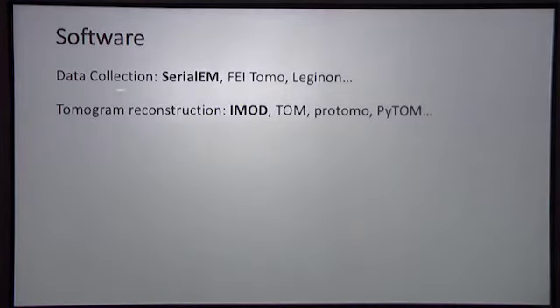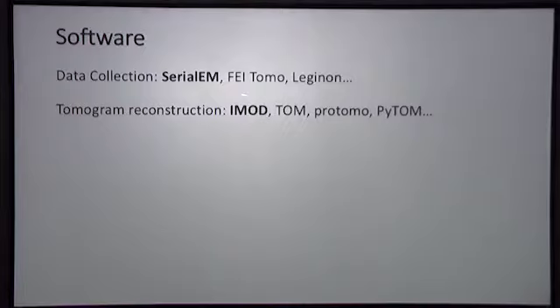So what software do we use to do this? There are multiple different packages available. For data collection on the microscope, there's SerialEM, there's FEI Tomo, there's Leginon. We make use of SerialEM for this. For tomogram reconstruction, so for taking the data and generating the reconstruction, there's IMOD, Tom, ProTomo, PyTom, and others. And in the lab, we mostly make use of IMOD.